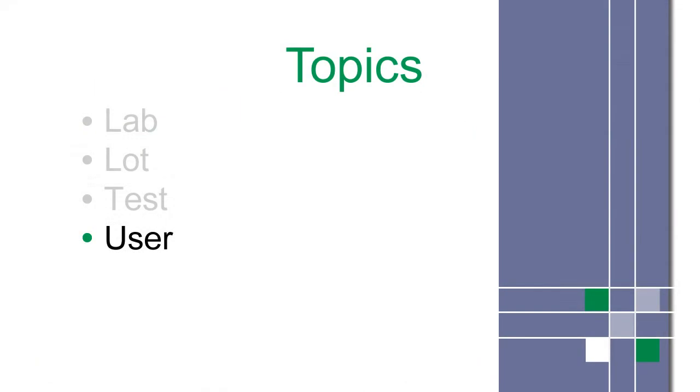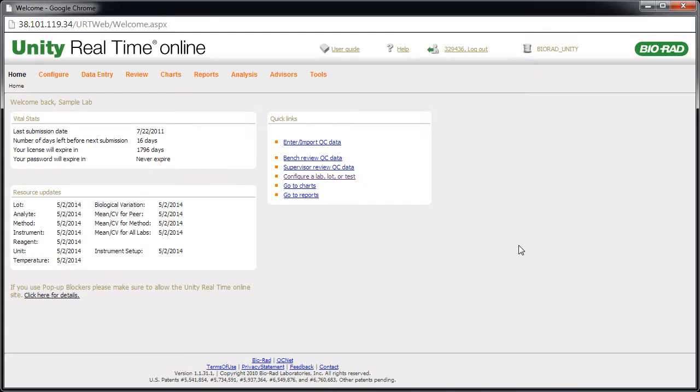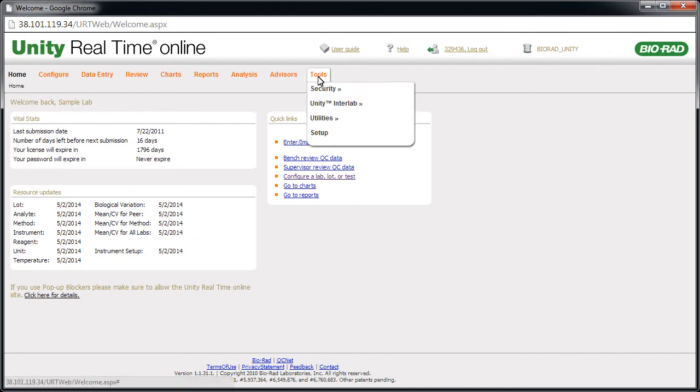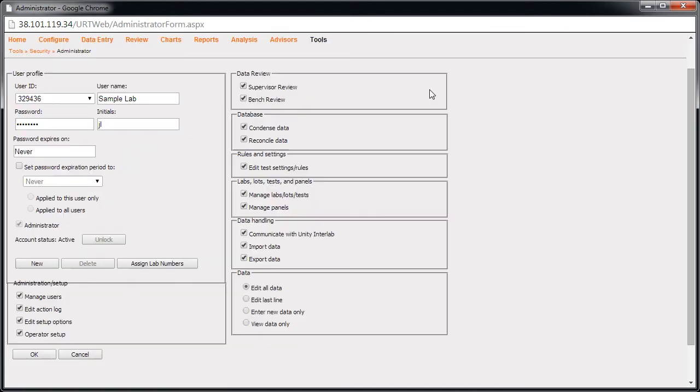Next, let's look at the setup of a user. Unity Real-Time Online provides profiles with passwords and permissions to control user access to program functions. To set up a new user, point to Tools, point to Security, then click Administrator. The administrator page appears.